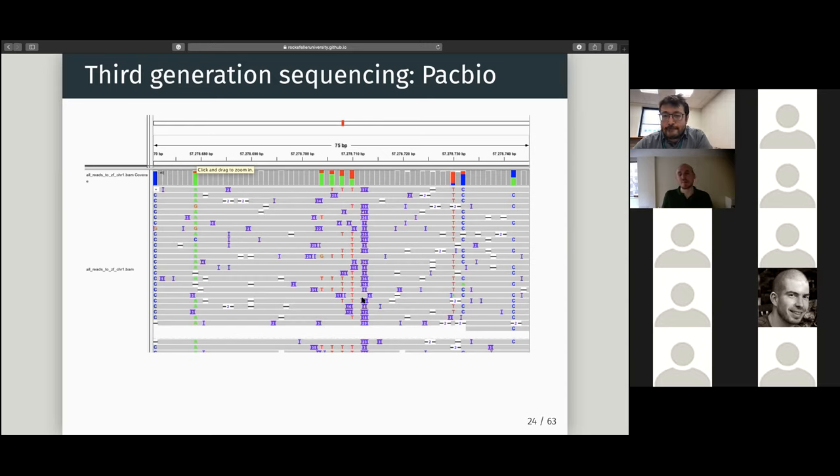Yeah. So the big problem with genome alignments is that even with long reads, the alignment can be deceiving, because depending on the region you're looking at, the alignment could be correct or not. And of course, the fact that you're not necessarily aligning the reads from the same individual to the reference of that particular individual adds complexity. But yes, here there appear to be a few reads that support the reference, while the majority of them actually have a deletion. So here the question is, what's going on? And what about the other, like the SNPs, or let's say the point errors? Can you distinguish those?